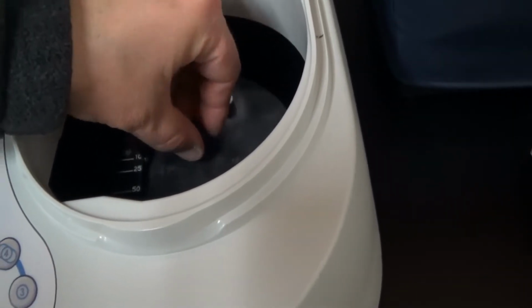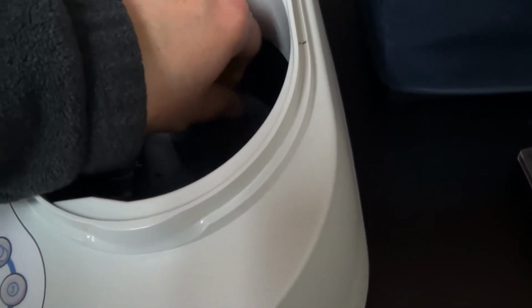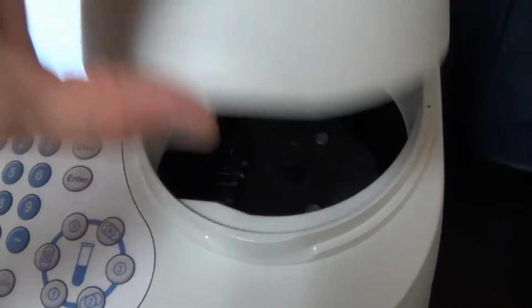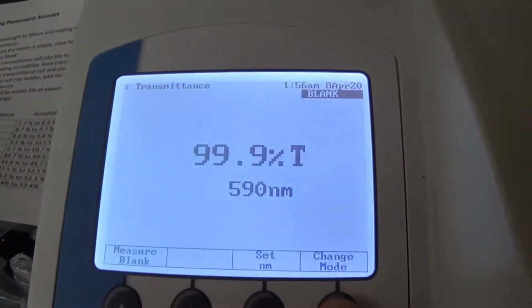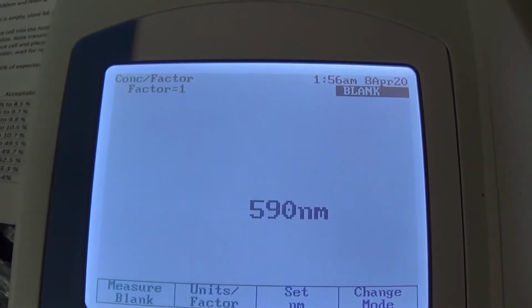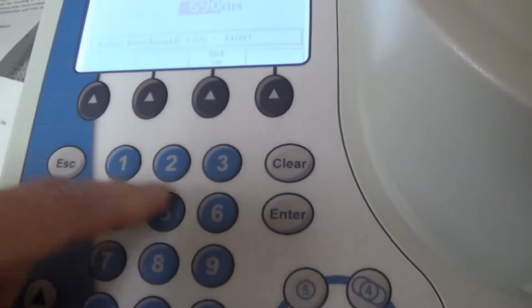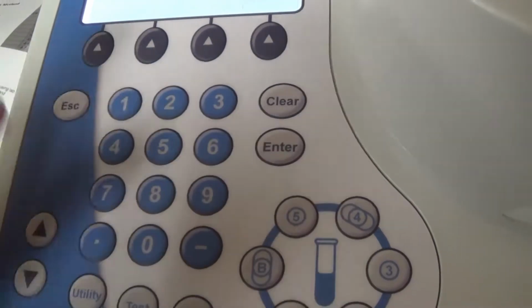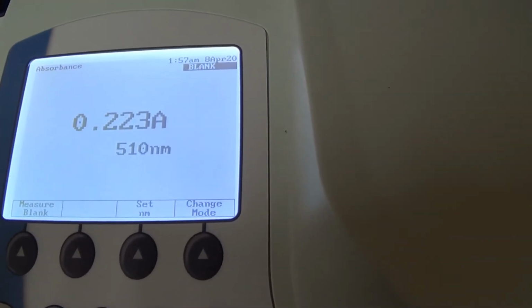Let's see here. There we go. And we need to change it back to absorbance. So I'm going to change the mode. Absorbance. So as you see, we are going to be running these on 510 nanometers. So I'm going to change it to 510. And it's ready to go when we need to.